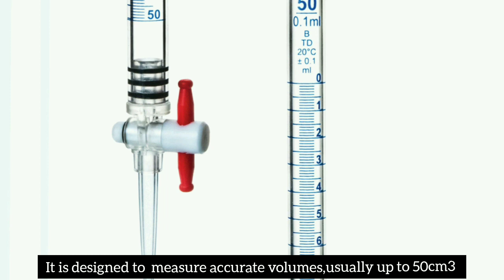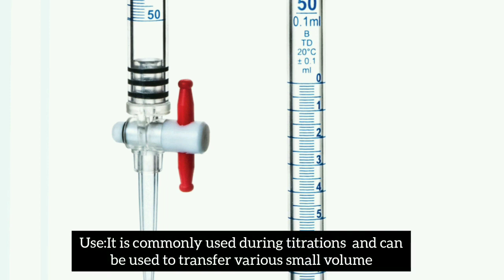Let's look at the use. It is commonly used during titration, and can be used to transfer various small volumes. So when you turn on the tap, you can drop the particular volume you want, or maybe during titration where there is color change, you close back the tap. That is what burette is used for.